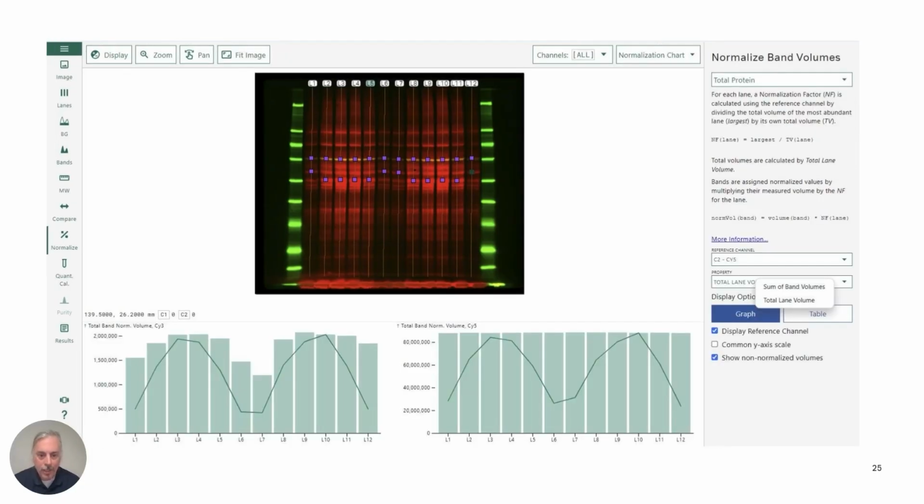And when we do the normalization, you can see on the right-hand panel, the green line that's going up and down here, that corresponds to the poor loading with different loading amounts. But then you normalize and everything should be identical. And then on the left-hand panel, again, the green line is showing the protein of interest, how that's going up and down. But then when we normalize, you can see it makes it a bit smoother. And that is like the true data there when we've done that procedure.